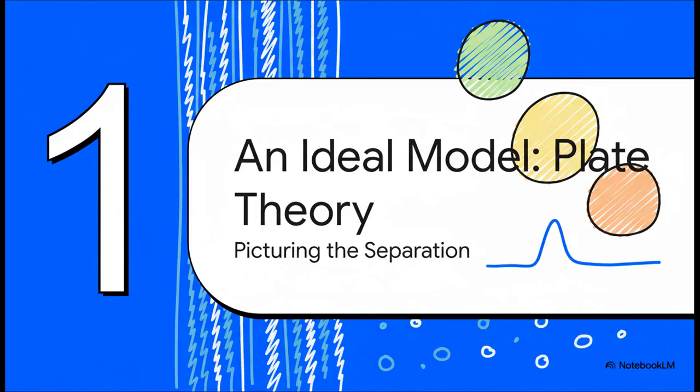All right, so first up is what we call the plate theory. Now I want you to think of this as our starting point. It's a simple, pretty elegant model that just helps us picture what a perfect, ideal separation would even look like.